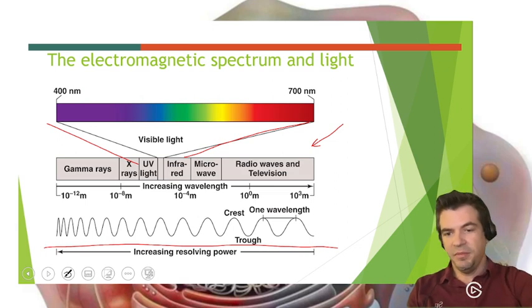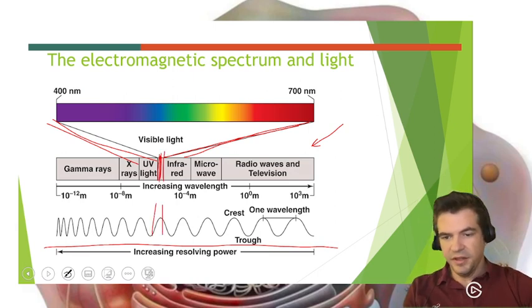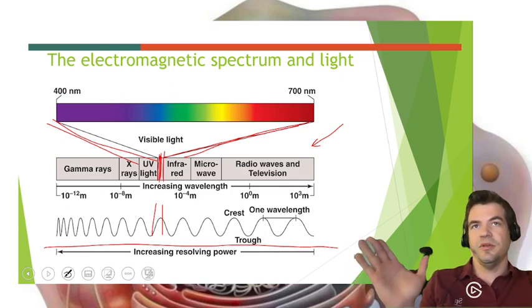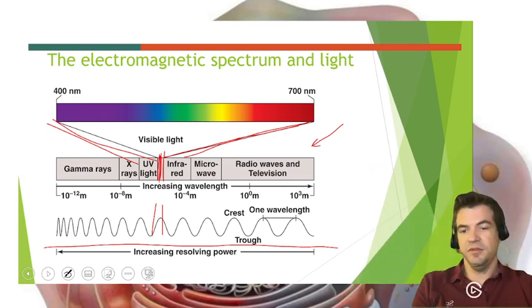But the main thing is that we see the small range right here that looks like this wavelength of light. All the purples, all the reds, and all the greens that we've seen are tucked into that little spectrum of light.